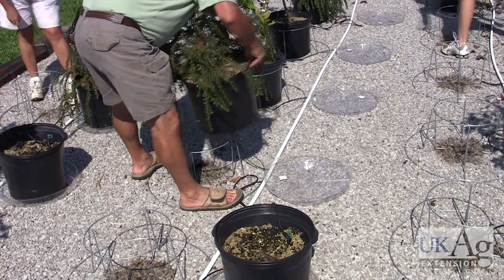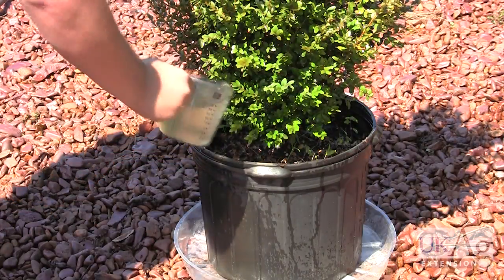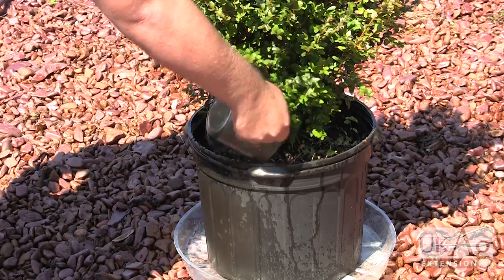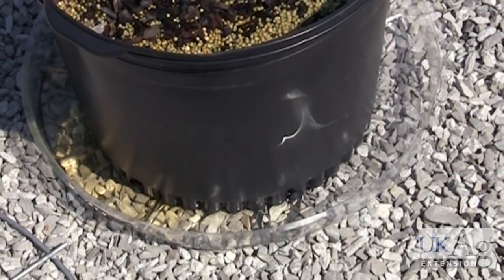Once your containers have drained, set them in the plastic trays. Pour on enough irrigation water to cause a measurable amount of leachate to drain from the container. This will depend on your container size and your measuring device.